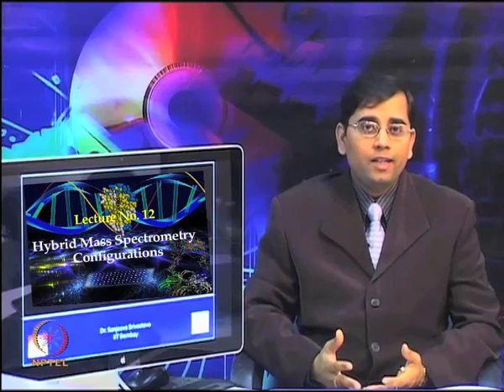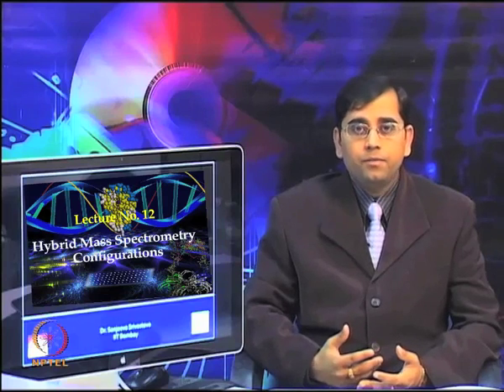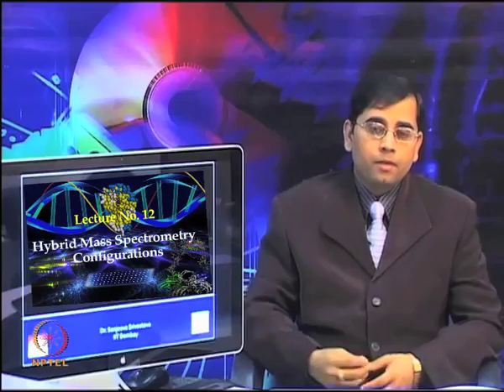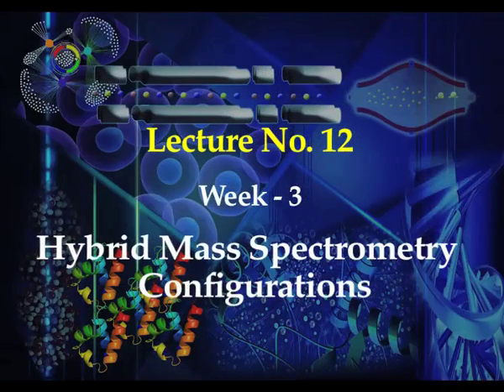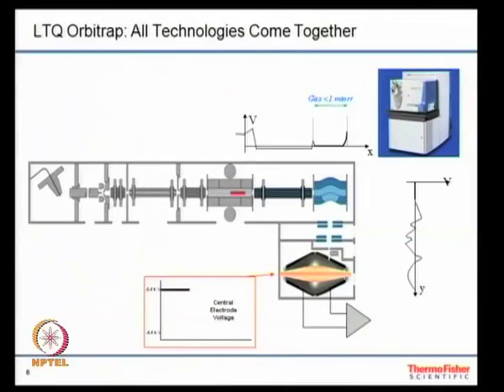There are several new advancements which have happened in this field, and to keep up the pace with these recent advancements, in today's lecture, I thought to involve a discussion on hybrid MS-MS configurations and talk with two leading companies, one with Agilent Technologies for QTOF and triple quadrupole, as well as the chip technology, and then with Thermo about the Orbitrap technology.